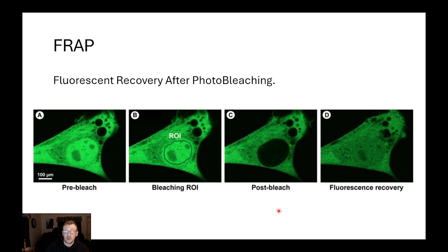Let's say, for example, you have a protein that is known to interact with the centrosome of a cell. So you can go in there with your labeled protein, you see the centrosome, you know where it is, you blast it with light, and then you start a time lapse, and then you watch the rate of recovery as dynein or a different transport molecule brings it to that centrosome. You can then calculate the rate of recovery, which then tells you something about the rate of action of whatever the protein is you're looking at.